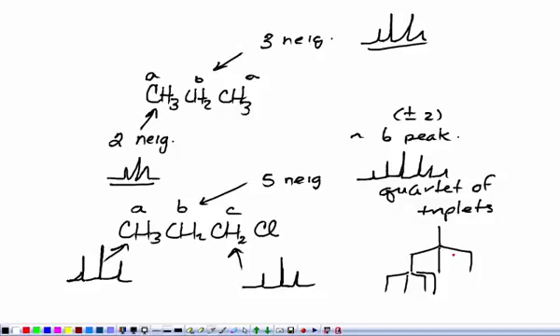But they usually overlap such that you see anywhere from 6 to 8 peaks. Okay, the only example I can give you is if, let's say I've got, because I don't have 3 hands, so I can't do a triplet of quartets, but I can do a doublet of quartets. So with the doublet of quartets, here they are. If they're far apart in one of the coupling constants, then I'll see 2 distinct quartets. But as they move closer and closer together, I could end up with 1, 2, 3, 4, 5, 6, 7 peaks. Or if they start to overlap this way, I could end up with 1, 2, 3, 4, 5, 6 peaks. Or they could overlap and I could end up with 1, 2, 3, 4, 5 peaks.